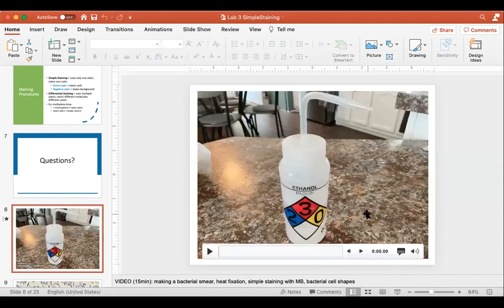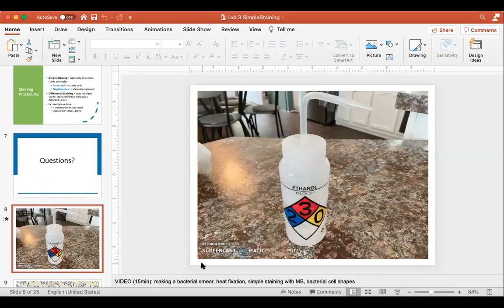All right, what we're going to do now is watch a video that shows us how to prepare a simple stained slide. It's about 15 minutes long, I believe.